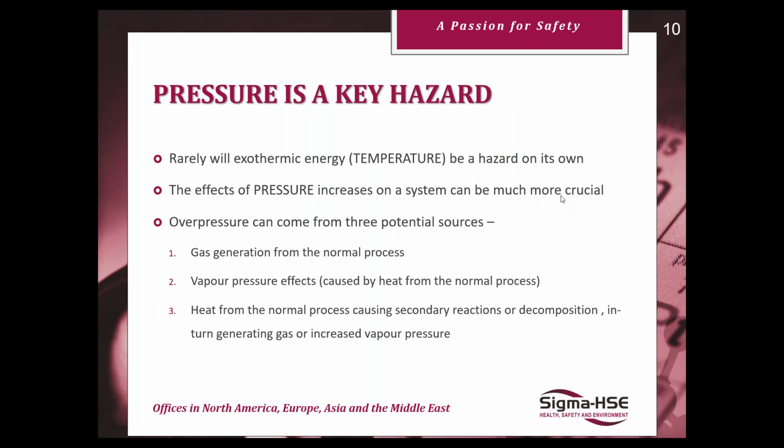So as we mentioned back then, pressure is a key hazard when we're thinking about a reactor which might have containment of a reaction system. If we have a decomposition, rarely will exothermic energy alone be a hazard by itself.